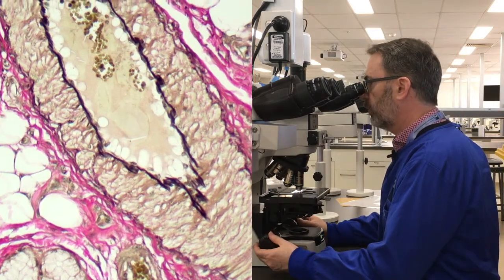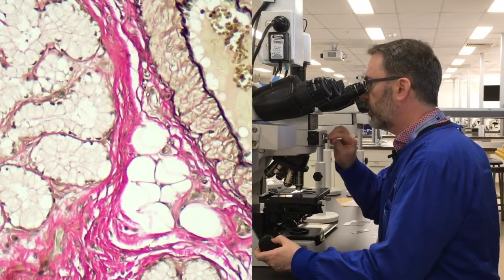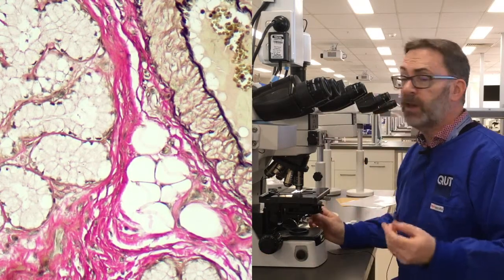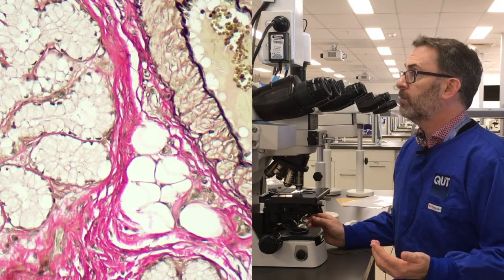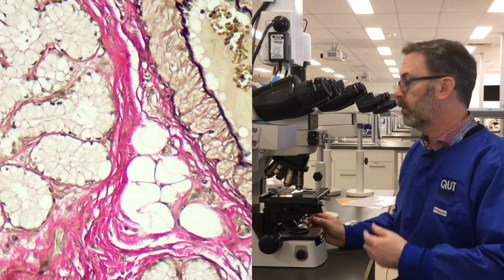If we look at the mucin within these glandular structures — the glandular mucous acini here — you'll notice that there's very little staining of the mucin itself. That's just another indication of the degree of differentiation that we can compare to the other slides as we move through.